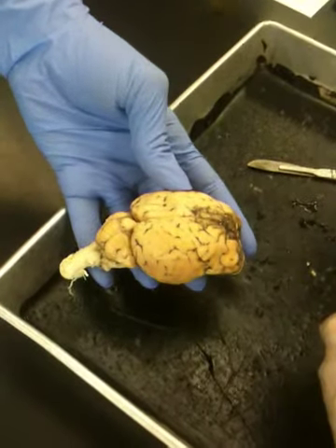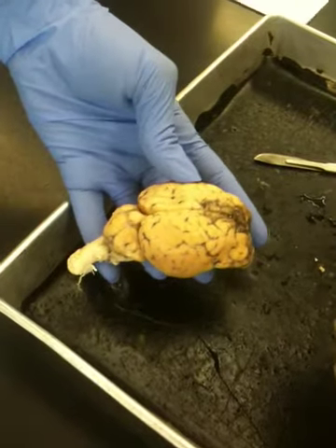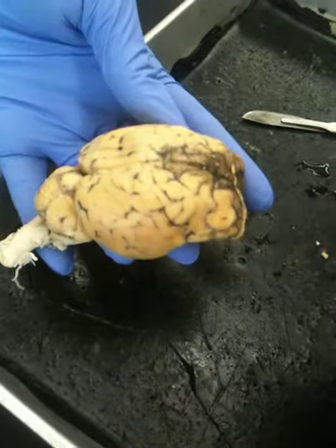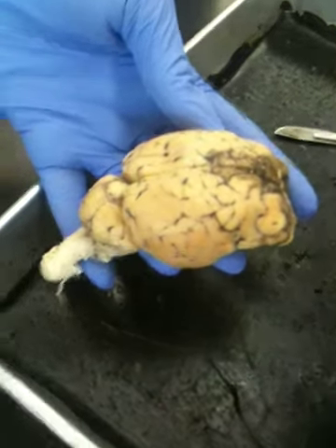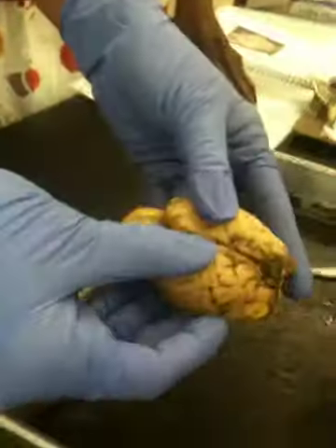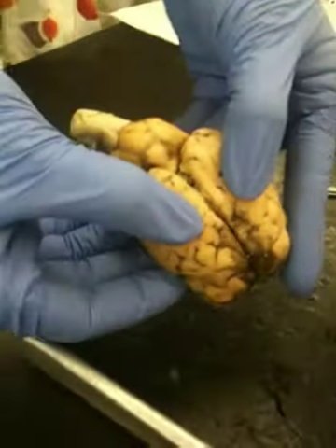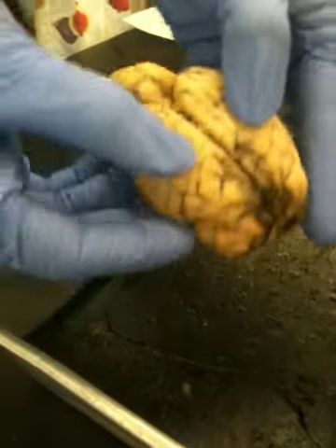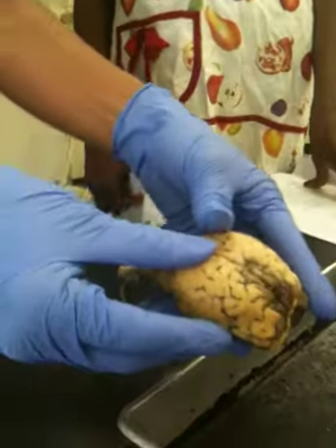Okay, so we cannot see the dura mater, but the arachnoid mater is where all the little veiny parts are. The falx cerebri connects the two lobes. So if you look very carefully in there, you can see the connective tissue. That would be the falx cerebri.